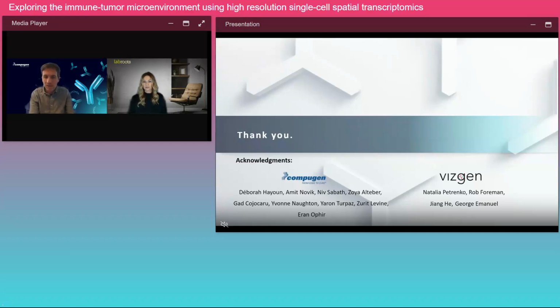And maybe the third reason is that because MERFISH is relying on probes and FISH, we believe this technology allows for detecting really rare transcripts, and we're often asking questions about such rare transcripts, while methods that rely on poly-A capture often are biased towards genes that are more highly expressed. So you lose some of the genes of interest.